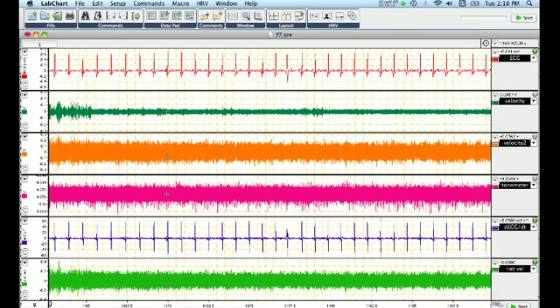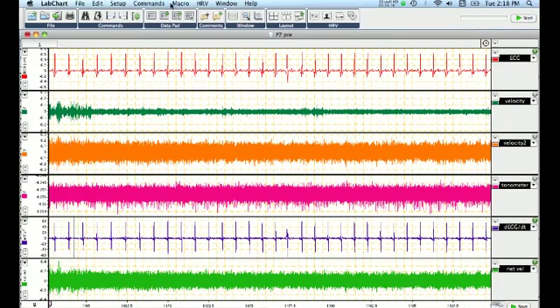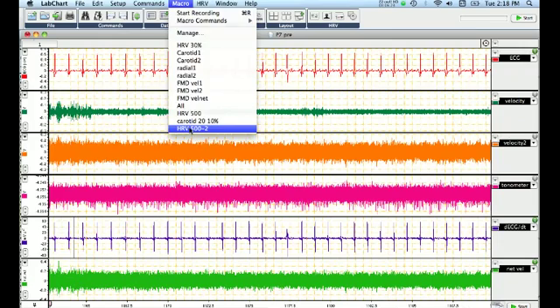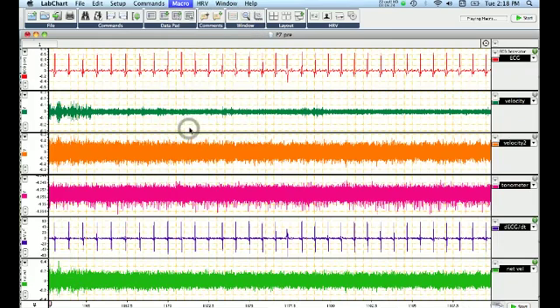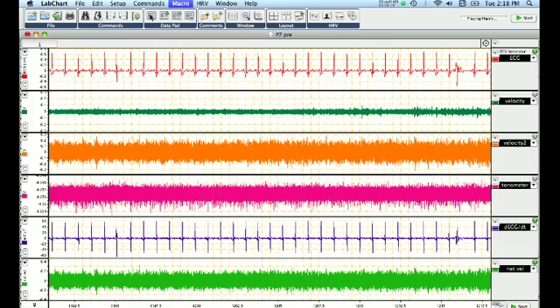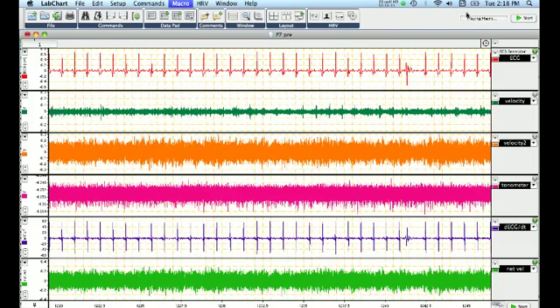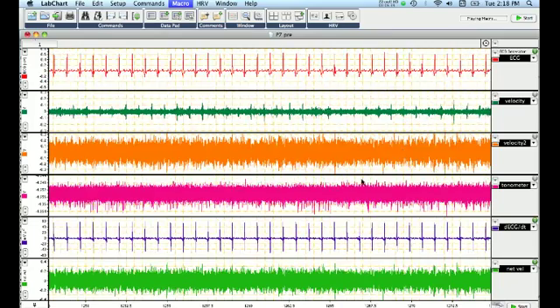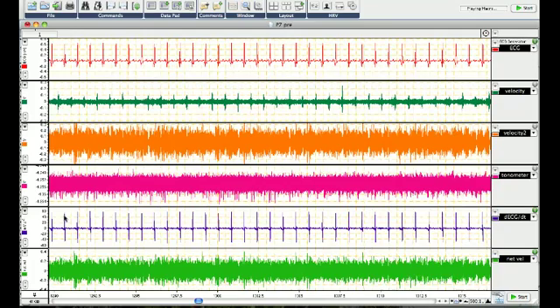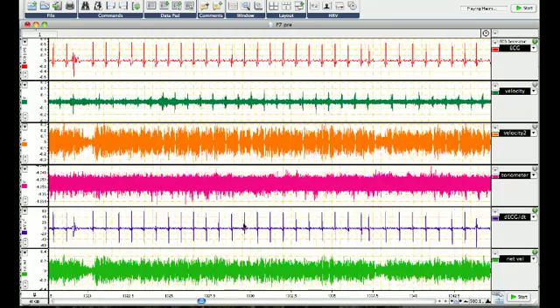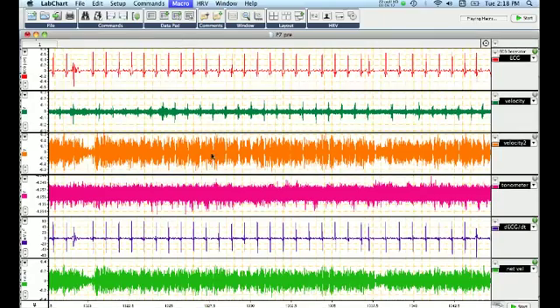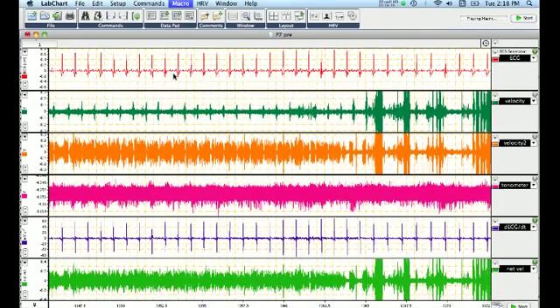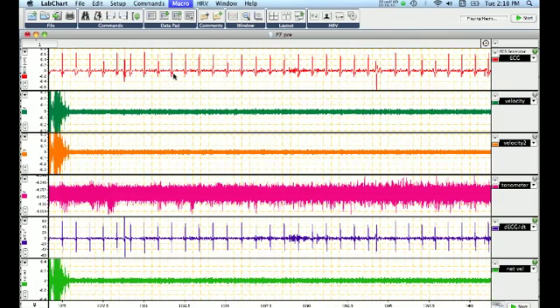So now we can run that macro by selecting an area on any channel, clicking macro, going to hrv500-2. Once I click this, you don't actually see much happening, but you'll notice that in the corner here, it's playing the macro, and every little while the screen updates. So in this particular case, that cursor is jumping from r-wave to r-wave, and dumping information about where it is relative to time into the data pad, and it continues this for 500 repeats.